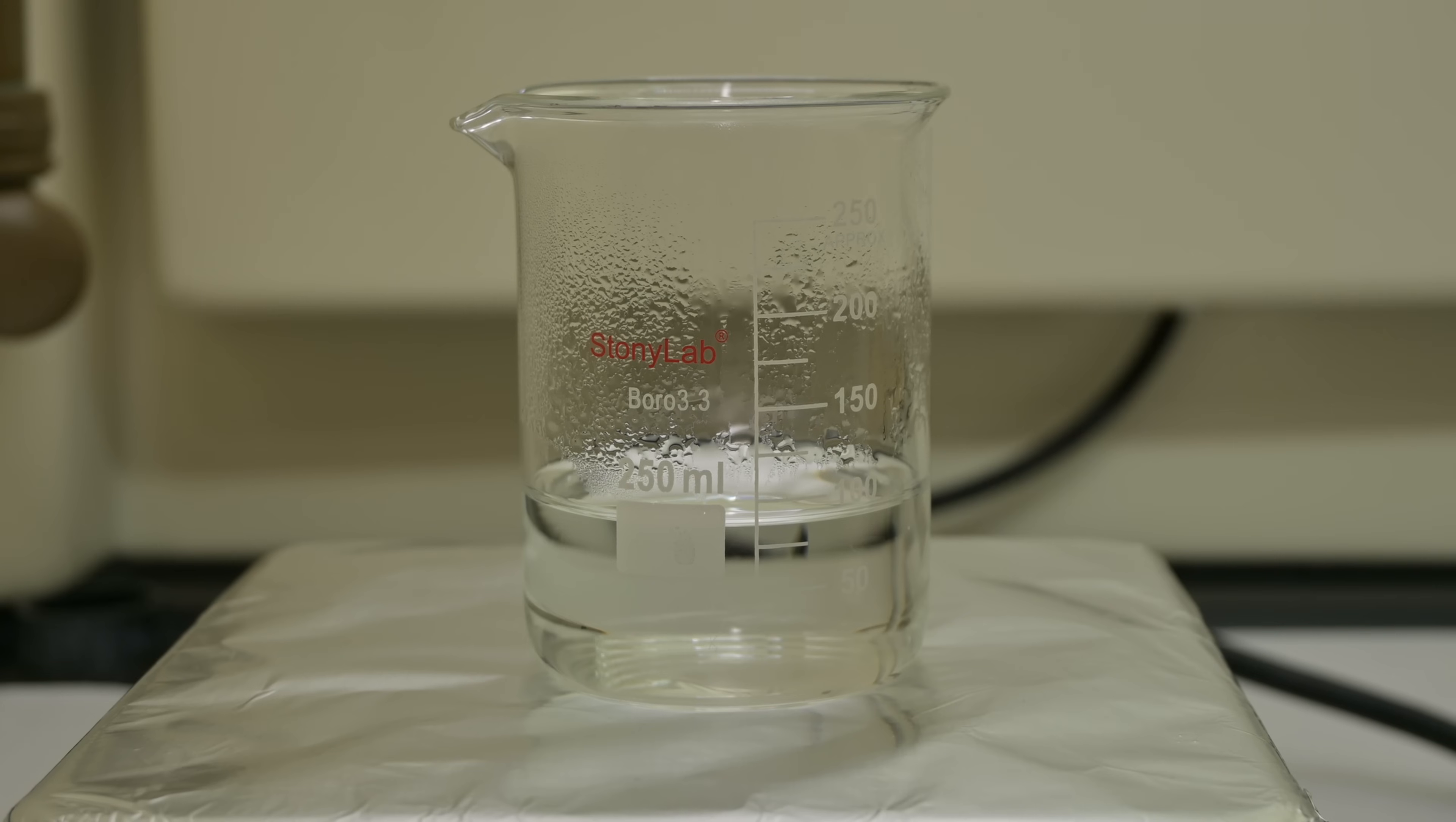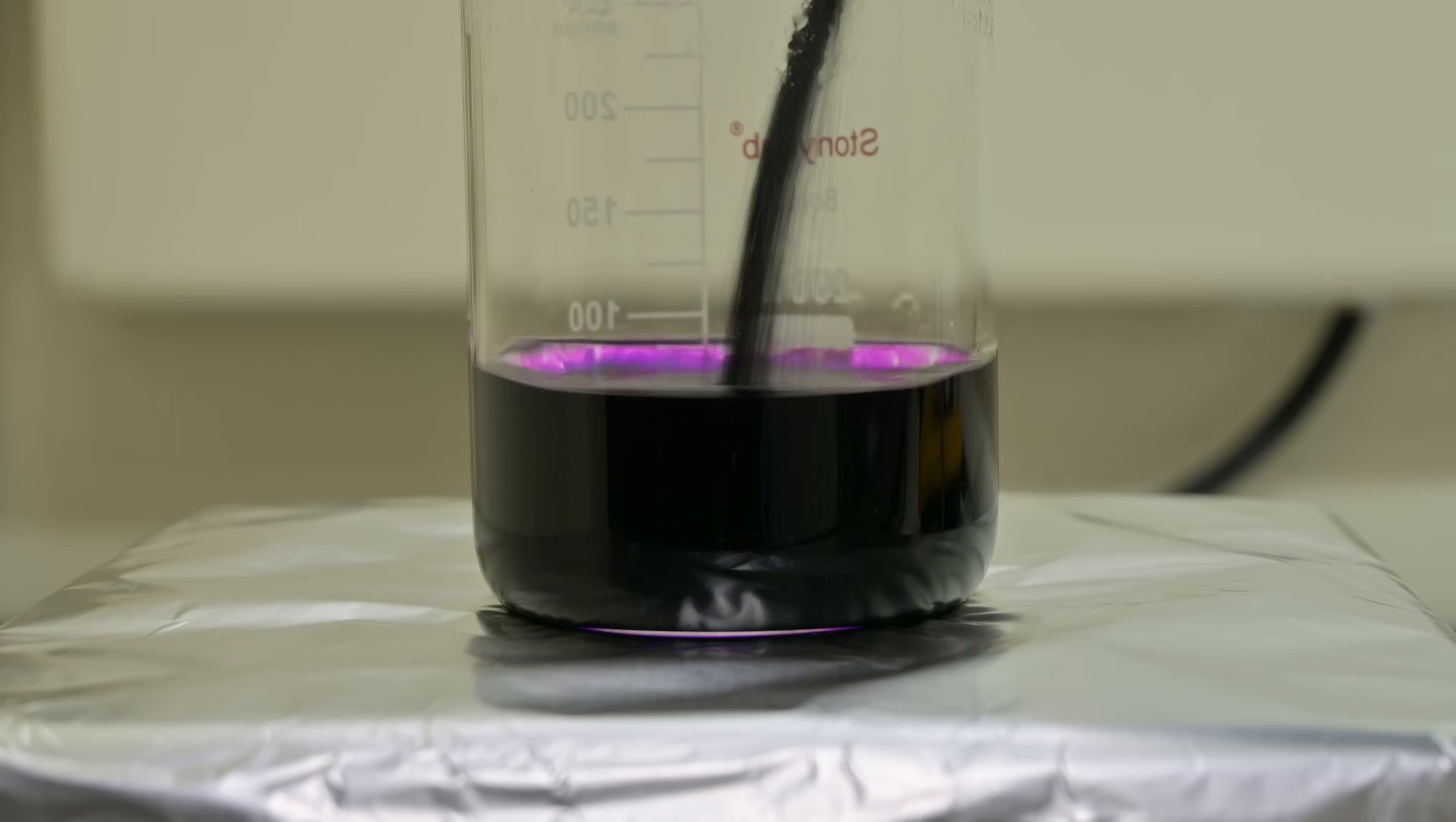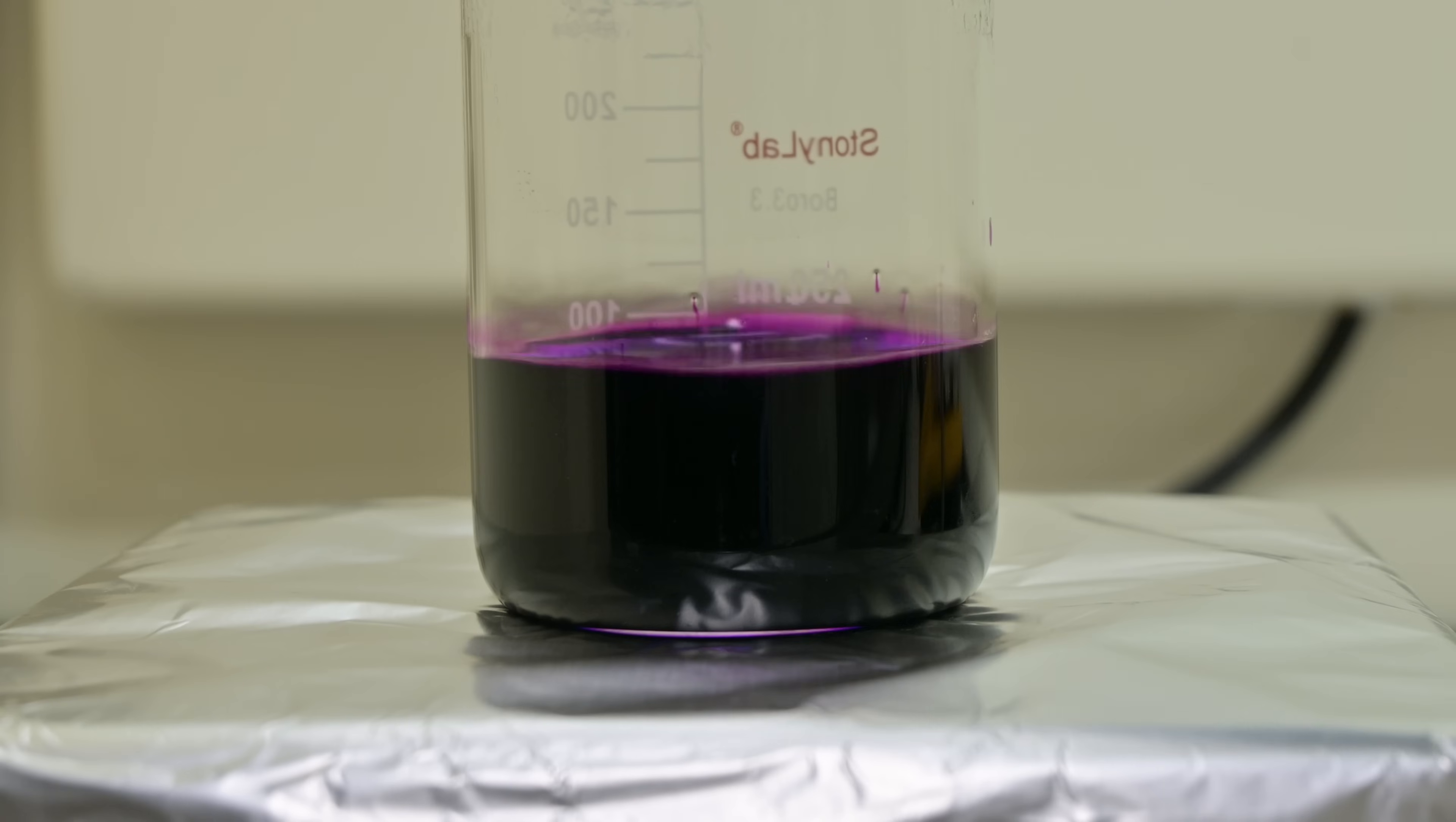While that's warming up, I prepare the oxidizing reagent. In a separate beaker, I dissolve 16.7 grams of potassium permanganate in 100 milliliters of boiling water. Potassium permanganate is a powerful oxidizer and it's going to oxidize the methyl group on the p-acetotoluidide to a carboxylic acid, transforming it into p-acetaminobenzoic acid.